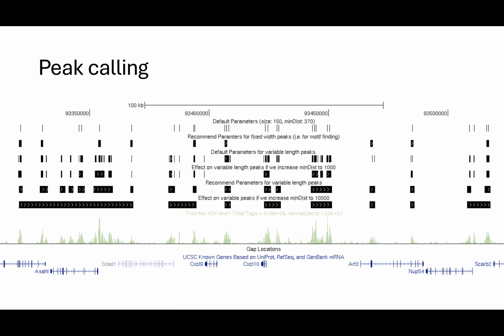Localized on promoter regions. What was that? Which histone marks are you looking at? H3K4 trimethyl is on promoters, and H3K27 acetyl is too, but there are different ones for different regions. Are there standard sizes? Not really.